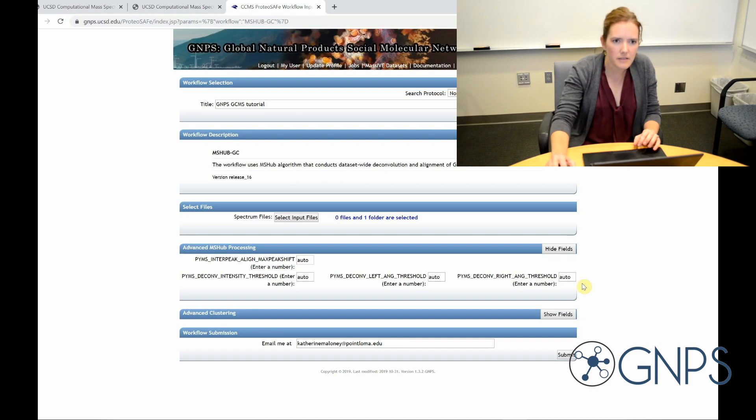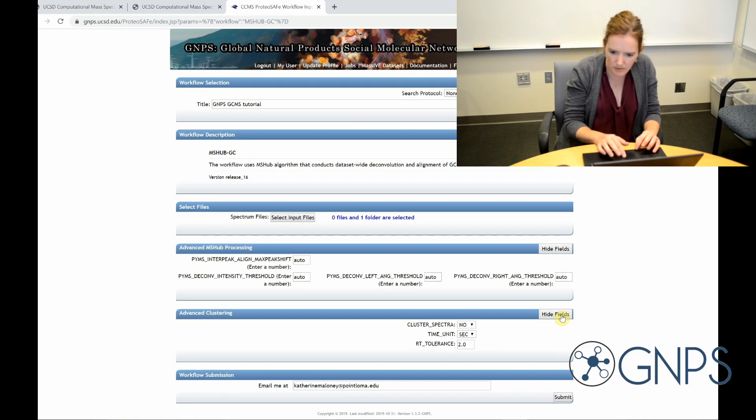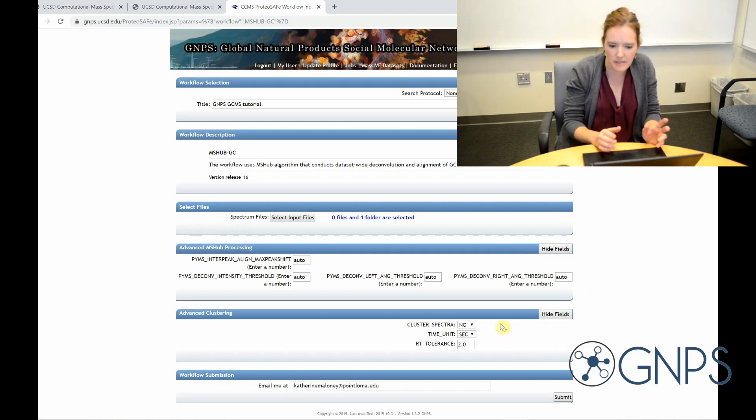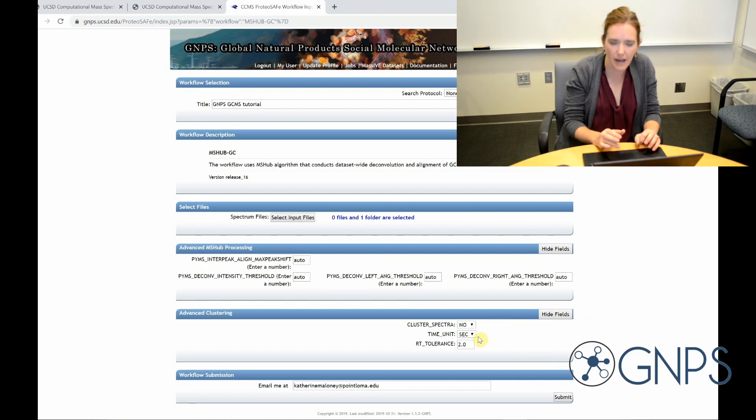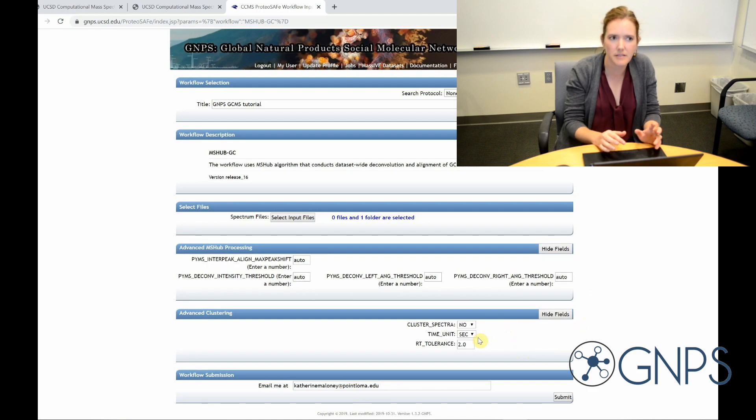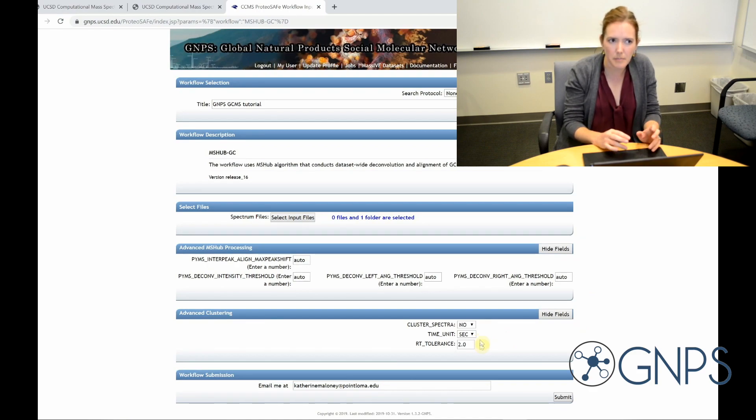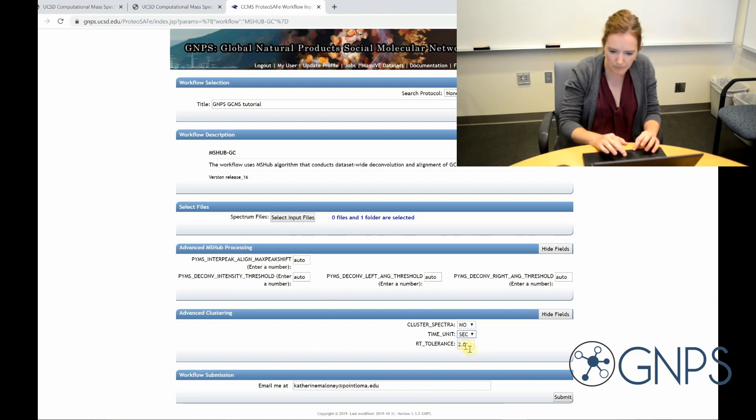In the advanced clustering section, I'm going to want cluster spectra should always be set to zero. The time unit I'm going to want to set depending on the type of files that I have. So if the data is in CDF format, you would set this to seconds. If it's an mzml, you would set it to minutes. And then I'm going to go ahead and click submit.